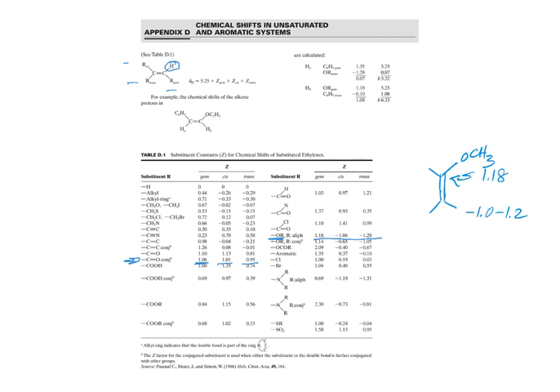Okay, and so why is the difference there? The place that they are may have different effects. Right, it does, obviously, because we have like 2 parts per million difference. In one case, it's going downfield 1, the other place is going upfield 1. Is it because the oxygen shifts the applied magnetic field of the alkene up more, so that there's more of an effect of that field on the geminal carbon as opposed to the opposite?